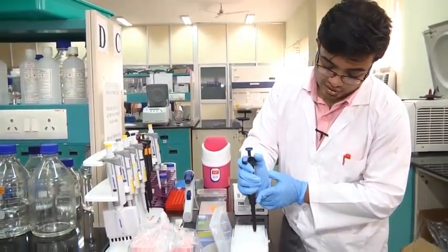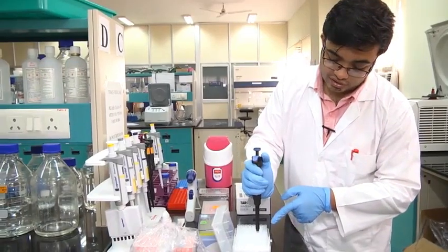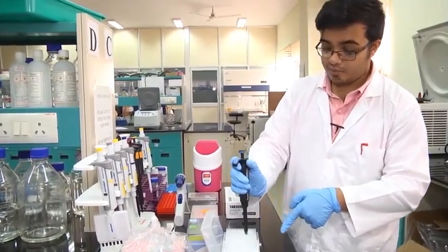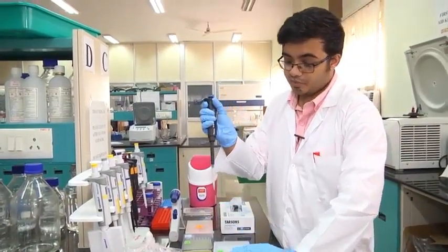Notice what I'm doing here. You slide down the lower portion of your pipette. It will fit very nicely into the tip. Give a slight twisting motion while you're pressing down, and the tip will automatically get attached to the pipette. You lift it up and you have your tip attached to your pipette.